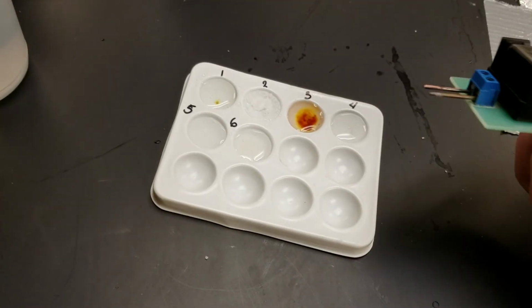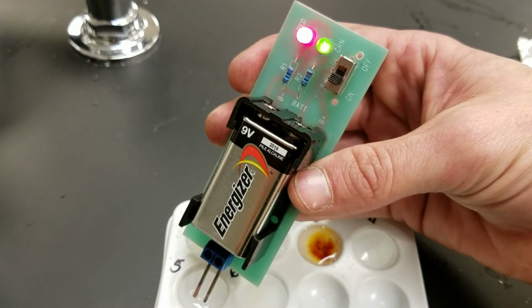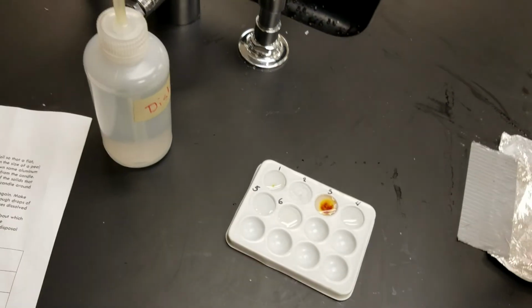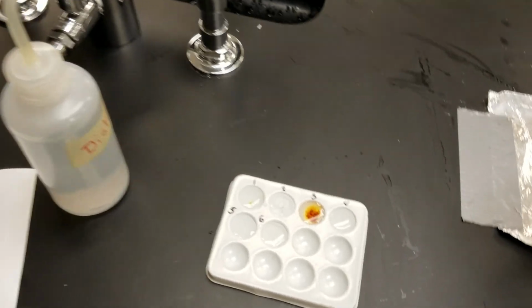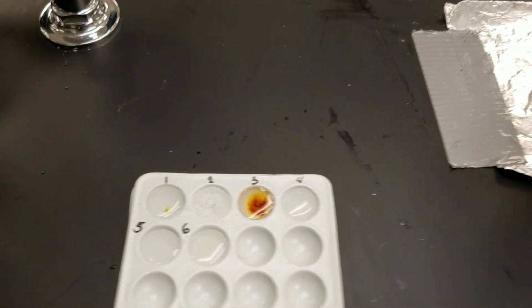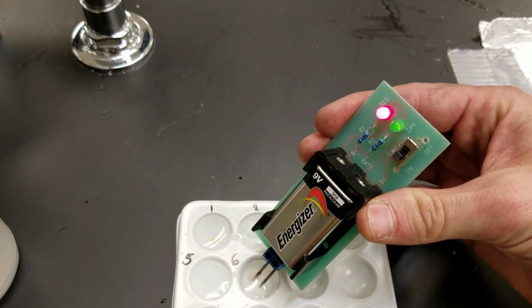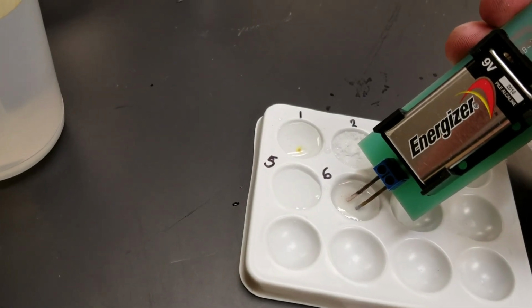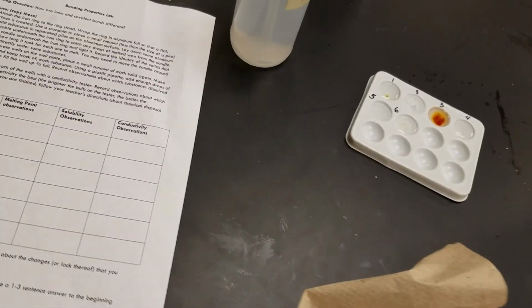Sodium chloride is next. Salt water. Both of them light up quite well. High conductivity for sodium chloride. Last one, ascorbic acid, vitamin C. This one, red light's on, green light is dim, so medium conductivity.